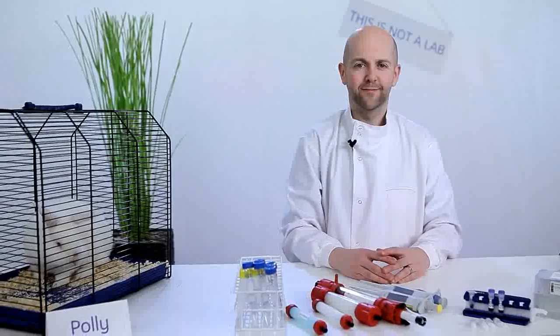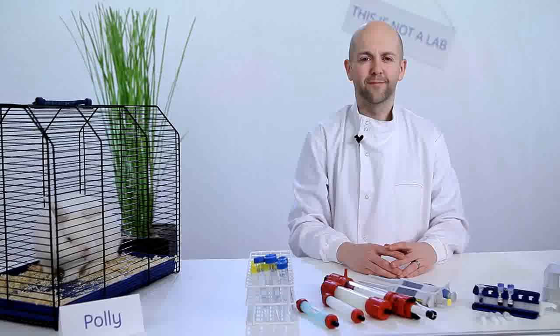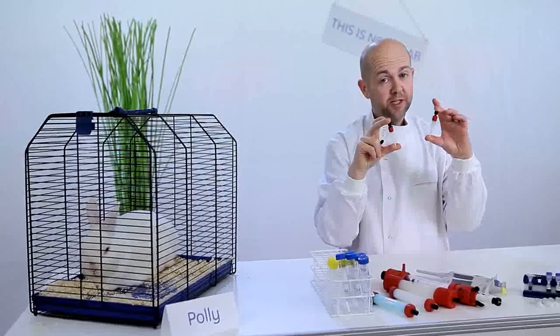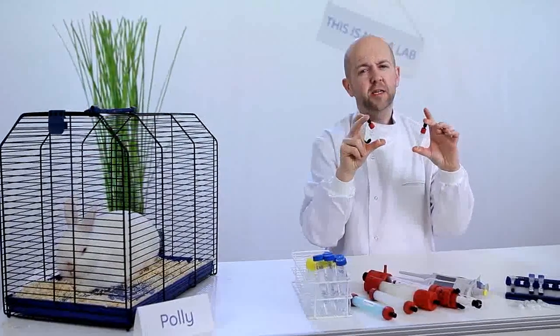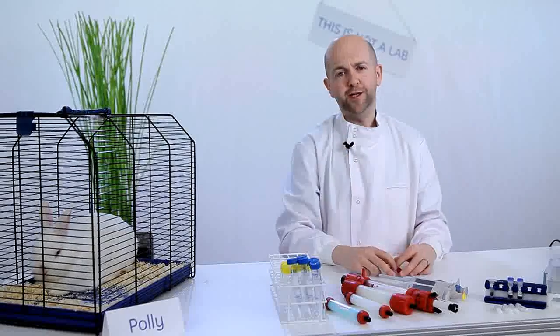Antibody purification is simple with HiTrap Protein A and G antibody purification columns, making it easy to purify polyclonal, monoclonal, and genetically engineered antibodies from samples such as serum, ascites, and cell culture. HiTrap Protein A HP and HiTrap Protein G HP columns are simple to use, easy to scale up, and will simplify your antibody purification.